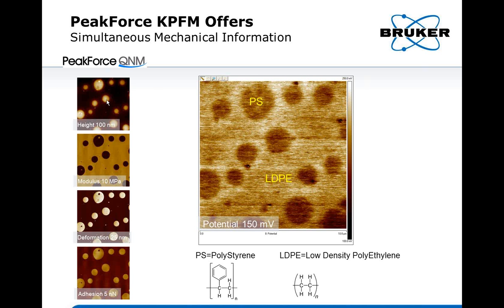Here on the top left is the topography, and then it also measures modulus, measures the deformation, which tells you the hardness of the sample, and also the adhesion, to tell you the chemical interaction between your tip and sample. So it gives you all those quantitative mechanical properties. And in combining with KPFM, it also gives you this potential map.